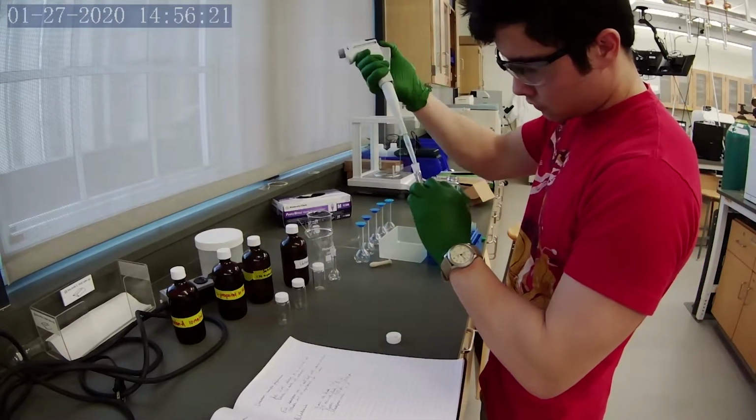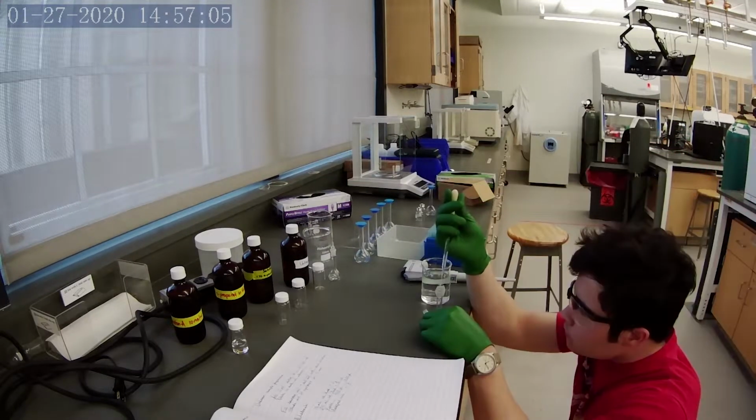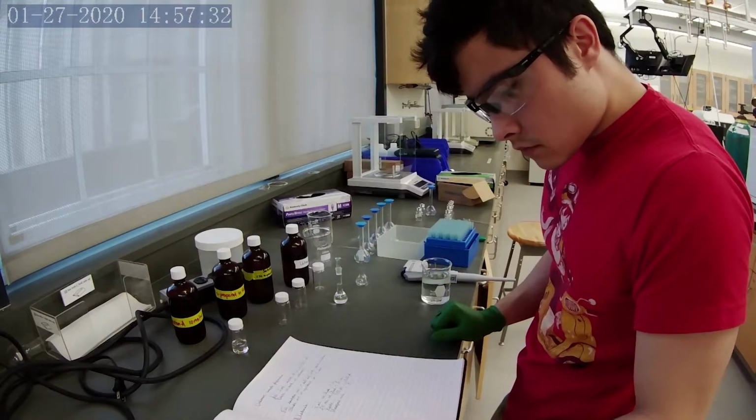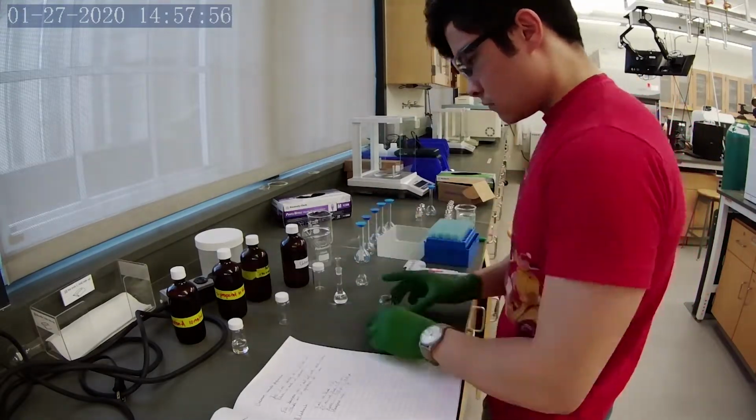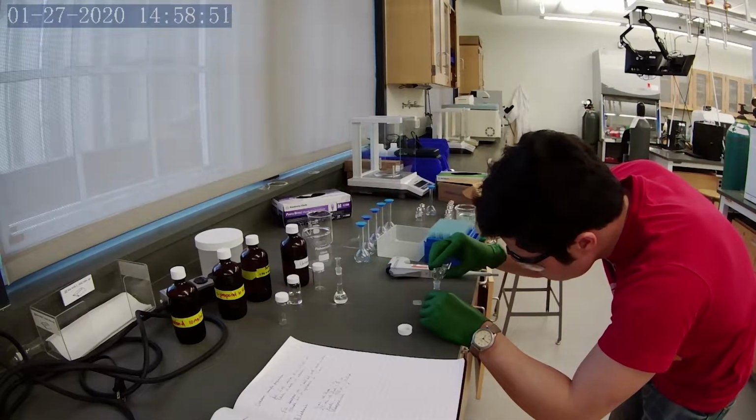So for some reason the camera was doing some goofy stuff and most of what I recorded looks like some kind of weird time lapse. So all I'm doing here is preparing all of the solutions as described in the handout.